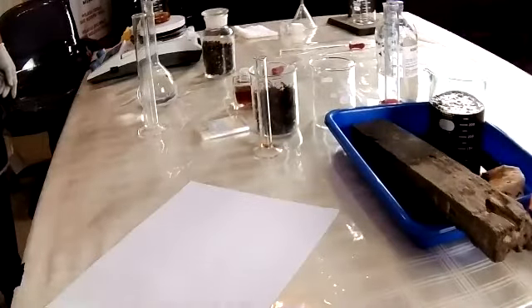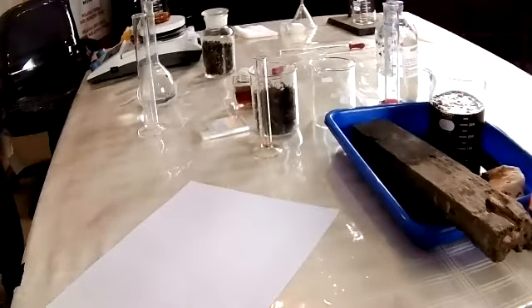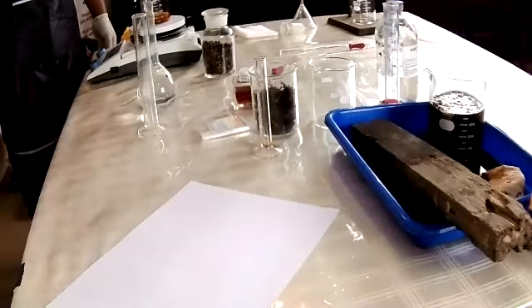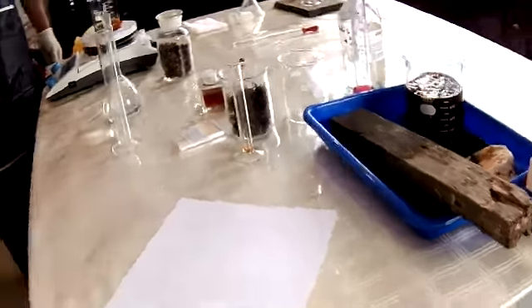And if you don't have any background in chemical science, then I hope that you can grasp the message, and what we're trying to explain here, this chemical reaction. And so we isolate the soluble and the insoluble.